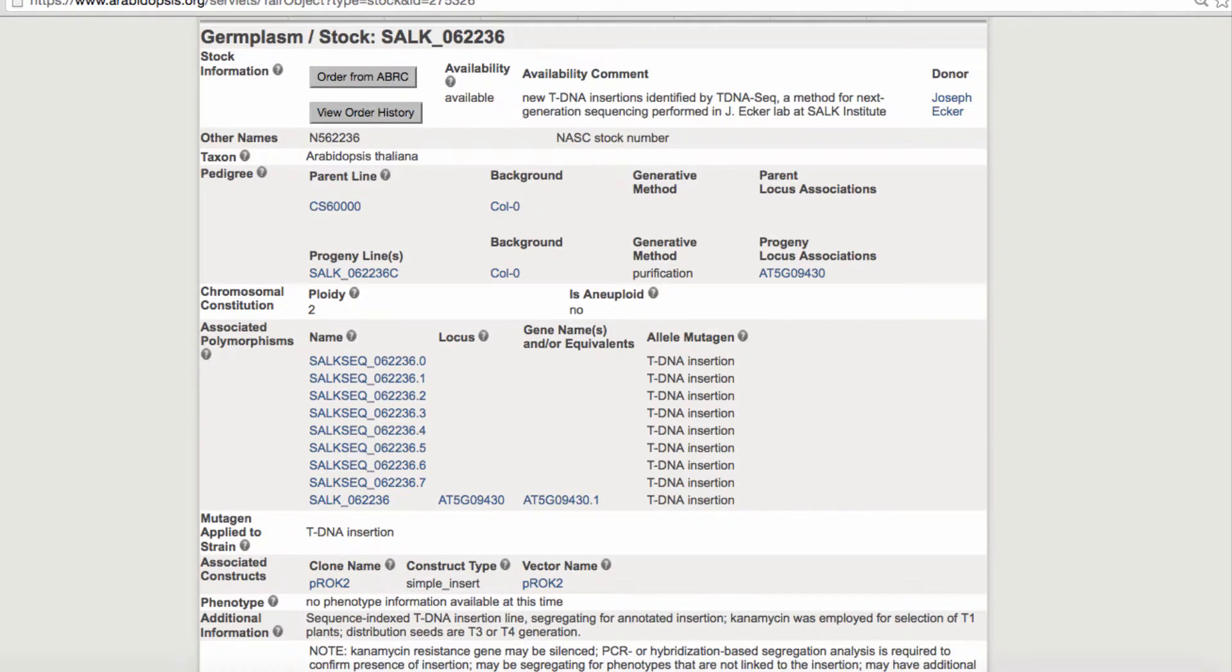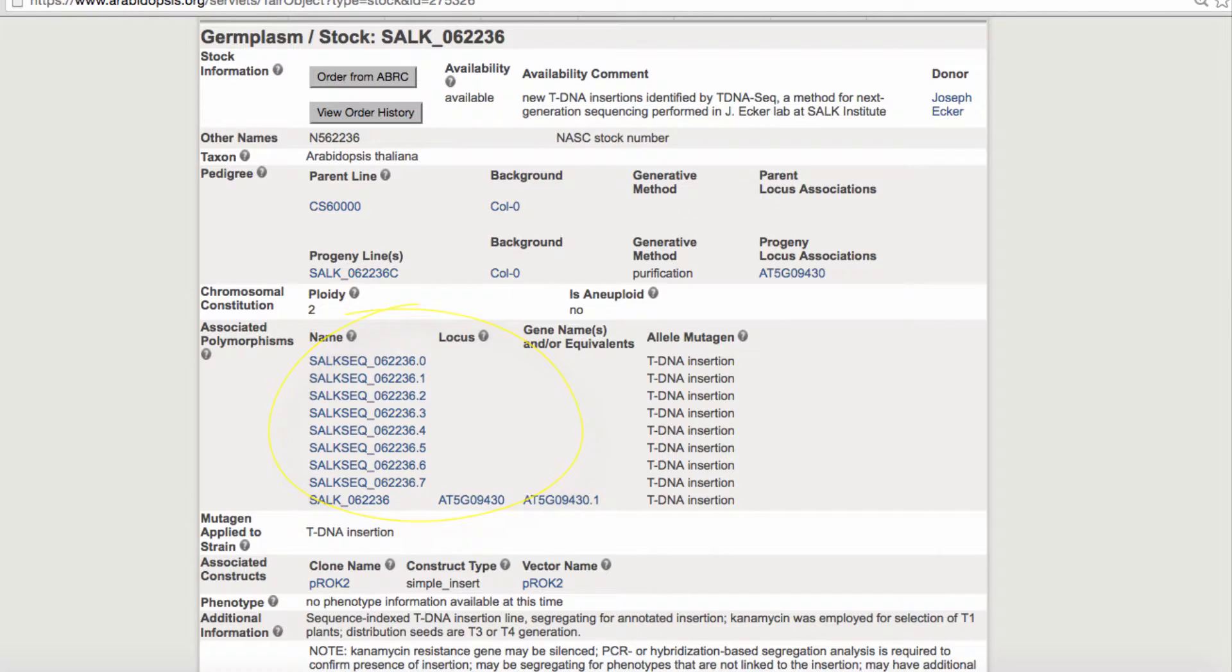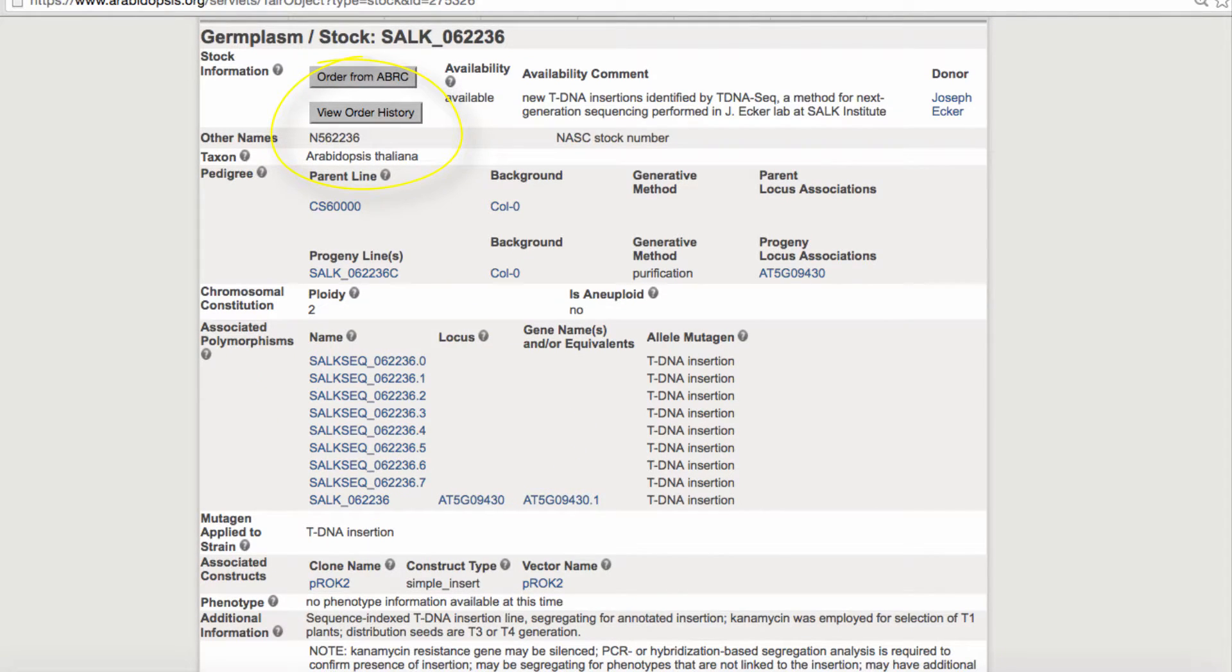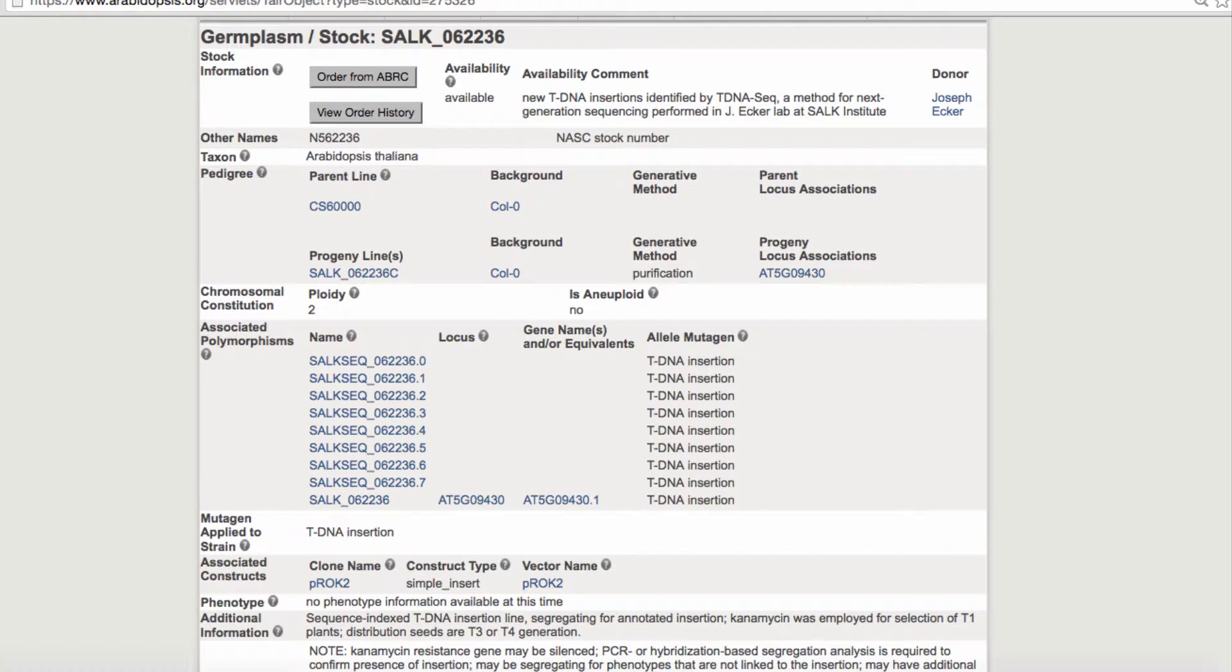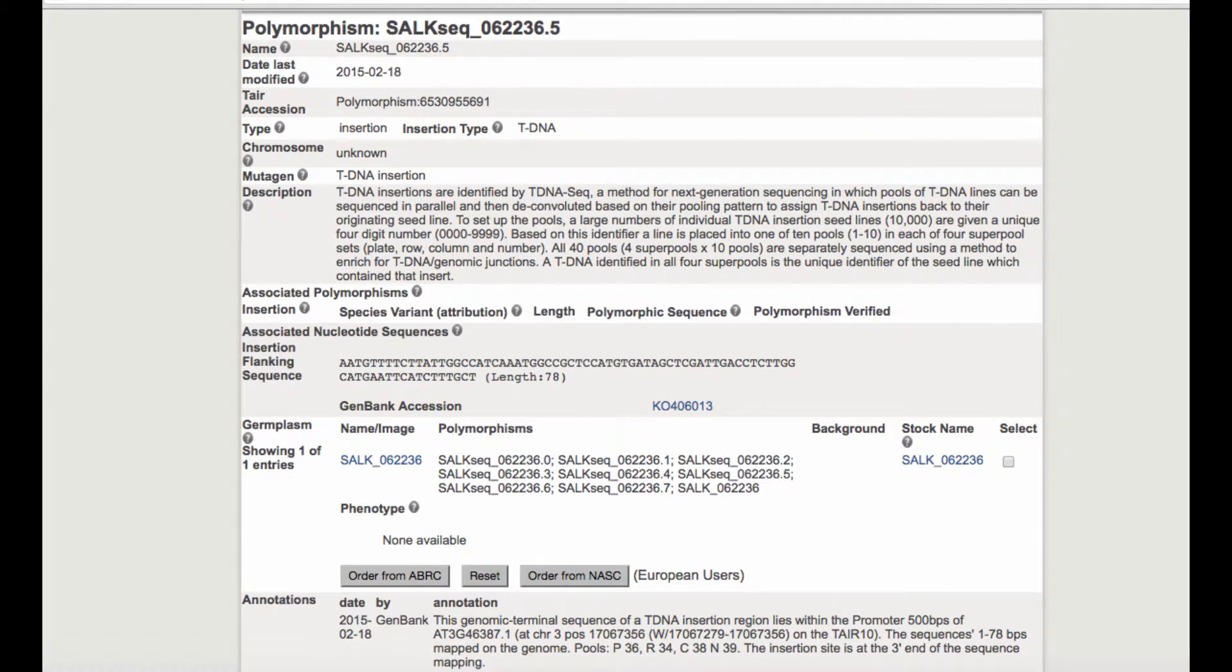If you click on the link to the germplasm, you'll see a list of all the polymorphisms or flank sequence tags found in this line, as well as links to order the stocks. In this line, there are a total of 9 flank sequences associated. Follow the links to the individual allele pages to find the information about their locations. They will likely be in different genes.